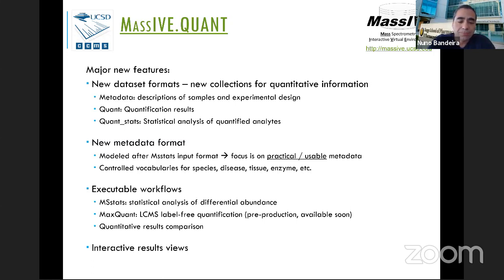Another approach, or intermediate approach, that has now also been supported is with DIA Umpire. When the data is processed, they export the MS2 spectra into a pseudo MS2 file. And those files can then be searched as regular data dependent files. And the files that you get with the IDs as a result can be used to create complete submissions also. So it's not perfect because ideally we'd like the IDs to go all the way back to the DIA file, not just to a processed pseudo MS2 file, but it's better than nothing.